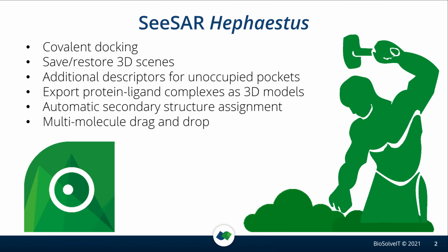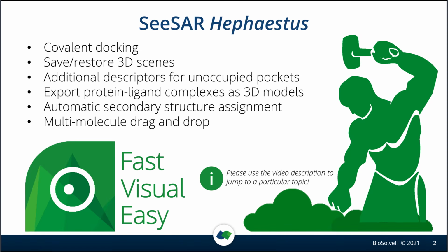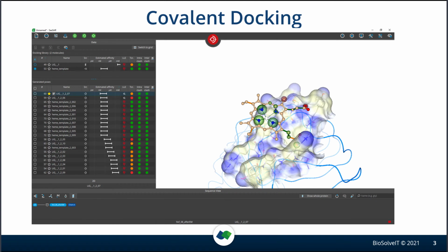Despite the inherent complexity of these newly added features, we have worked hard to stay true to the spirit of SeeSAR, which is to keep things fast, visual, and easy. In the remainder of this video, you'll get a walkthrough of these new features in SeeSAR to learn and understand how to use them best in your own drug design projects. As always, if you would like to skip to individual segments of the video, please use the timeline annotations in the video description below. Let's begin with covalent docking.